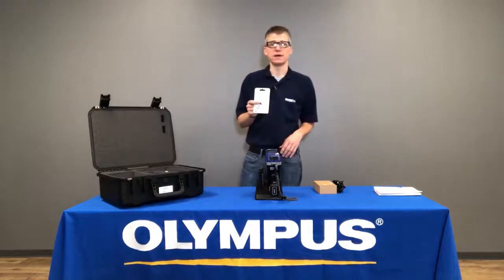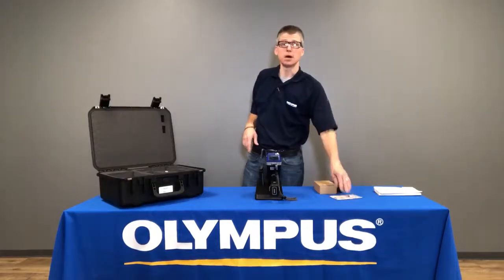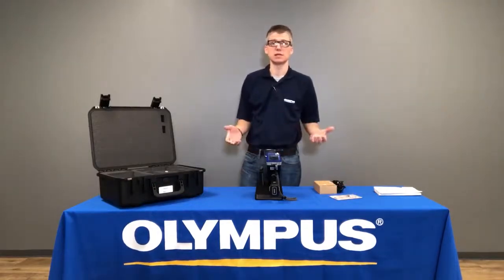One of the key items is the Wi-Fi adapter. The Vanta is a modern connected device and connects to the internet for software updates and wireless data management.